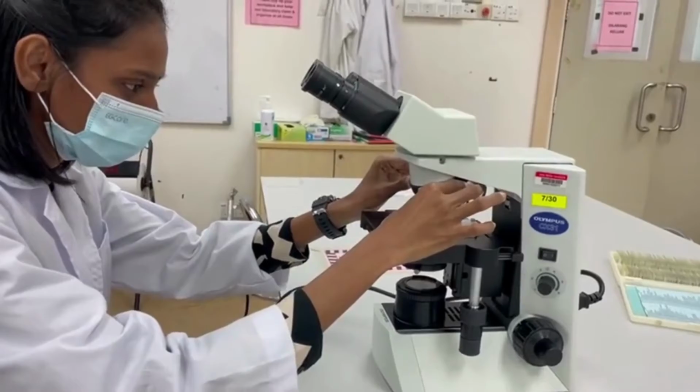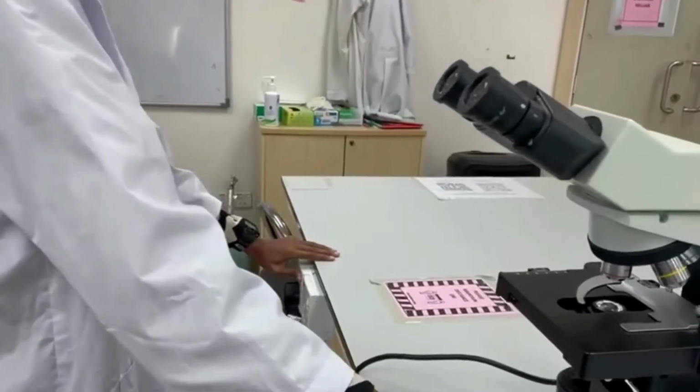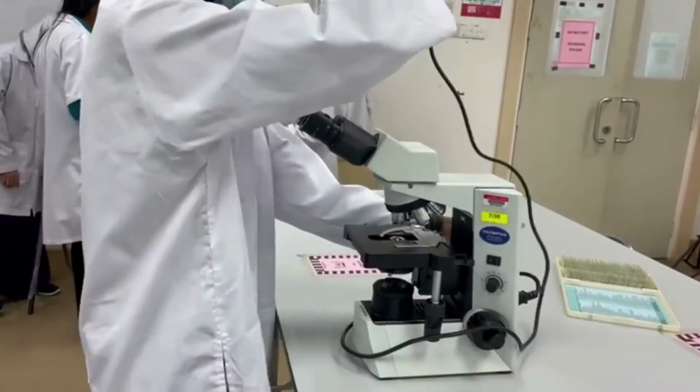First, make sure the scanning objective lens, which is the 4 times objective lens, is placed back at the center of the stage. Then turn off the light switch. Turn off the power. Tie the power cord cable below the body arm of the microscope.